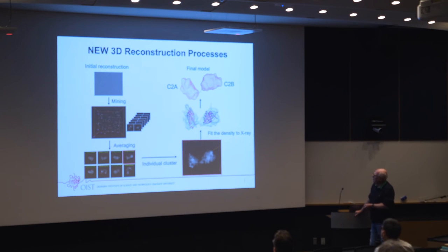And then in this particular case, it fished out a few hundred of them, but they are all in different conformations. However, when you analyze all of them, you find out that they form clusters. So there are a number of ways that the molecules like to be in there. And of course, if it's a cluster, then even I could say, well, it maybe makes sense to average within the cluster. So we proceeded that way. We had all these different structures that we clustered, and then you can make averages and fit them to the X-ray structure, and then you can discuss the model.